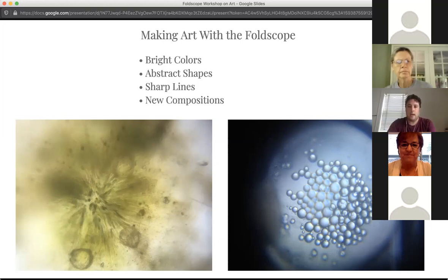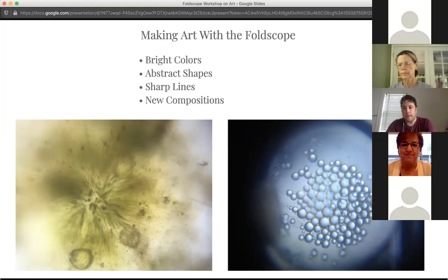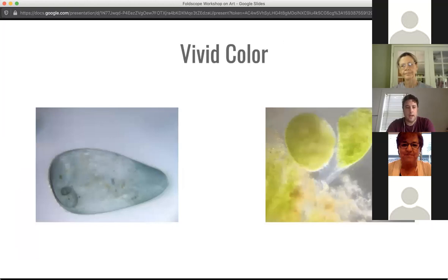And on the right is a minnow egg, photographed many years ago when I first started — one of the first things I ever photographed with a Foldscope. This minnow egg, if you just saw it normally, would be a little round ball about the size of a pinhead. Under the Foldscope it magnifies dramatically into these really interesting textures and arrangements of shape. Talking about color: color becomes really vivid to me under the Foldscope in really interesting ways.